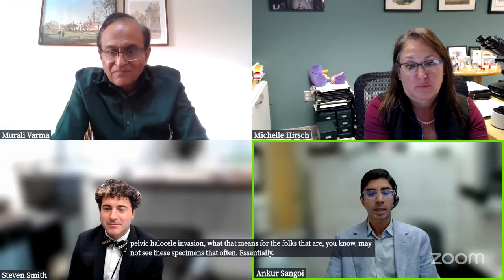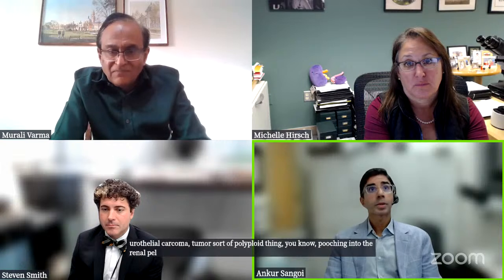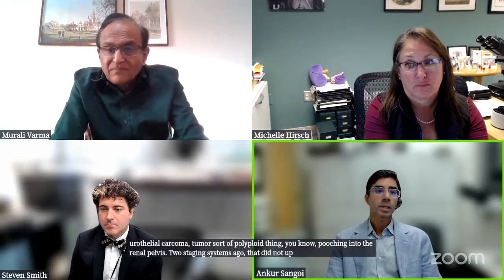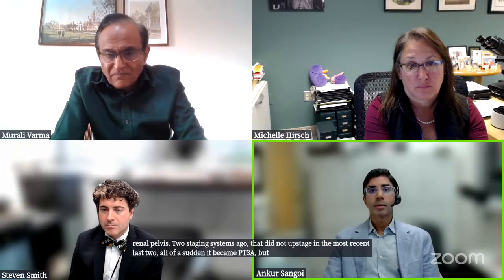You bivalve the kidney and you look at it. It looks like a urothelial carcinoma, a polypoid tumor pooching into the renal pelvis. Two staging systems ago, that did not upstage, and in the most recent two, all of a sudden it became pT3a. But there's really no rules or explanation as to how you get to pelvicalyceal invasion.